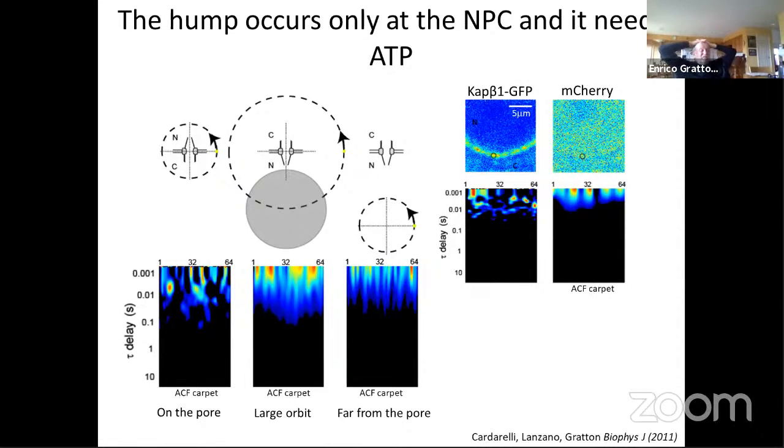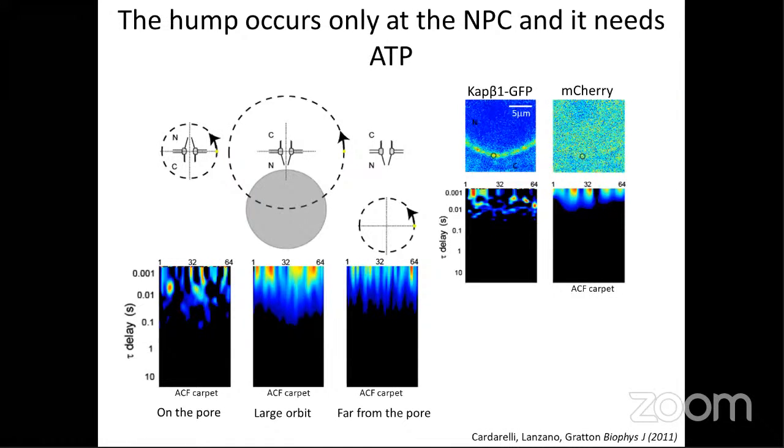Because it's center of mass. So this is particle tracking, which gives you the center of mass. And that was the discovery people made 100 years ago, that if you can get the center of mass, you can get an enormous precision in the position. Yeah, exactly. Yeah, any other question from the audience?